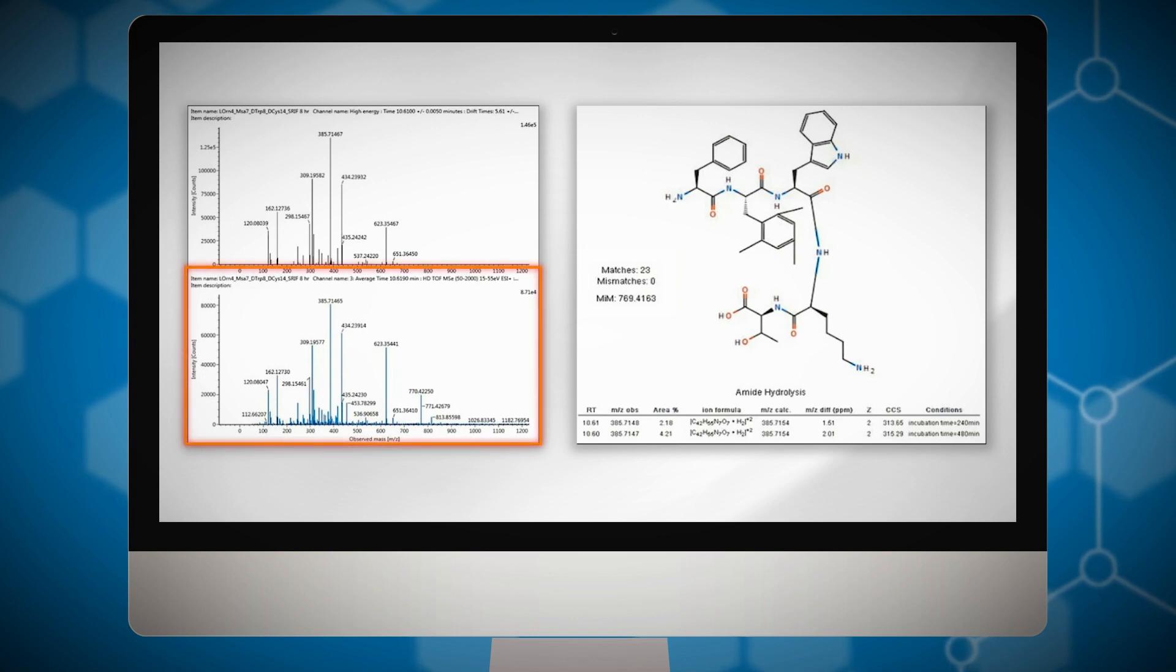The bottom panel here shows the non drift time resolved spectrum and the top is the spectrum after the application of drift time resolution. A number of potential product ions have been removed from the top spectrum because they were determined not to be precursor related.